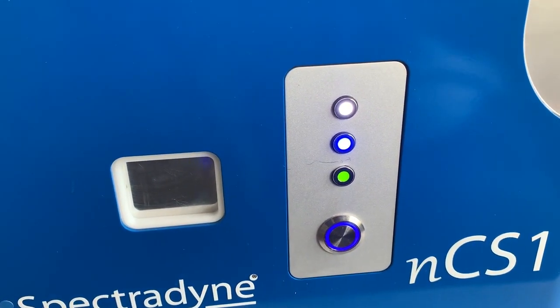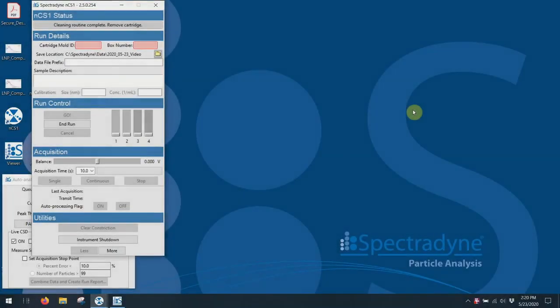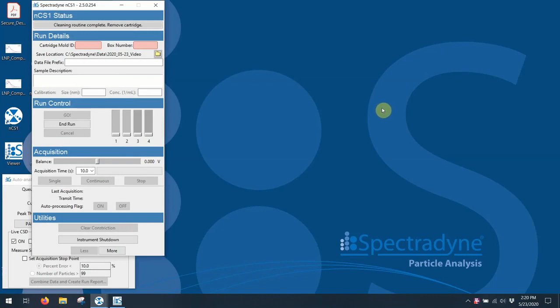And up the motor brings the sample, and we're ready to go. Once the cartridge has been put into the instrument, everything at this point on is under computer control.